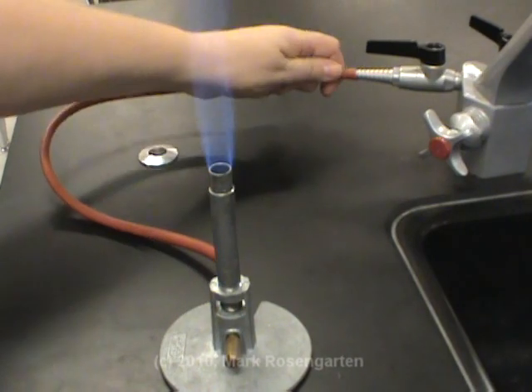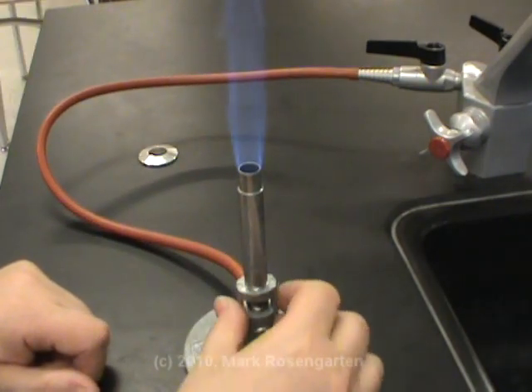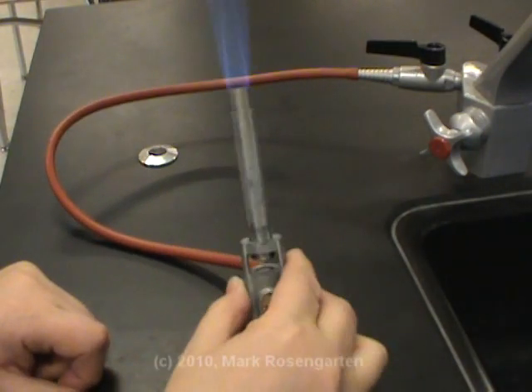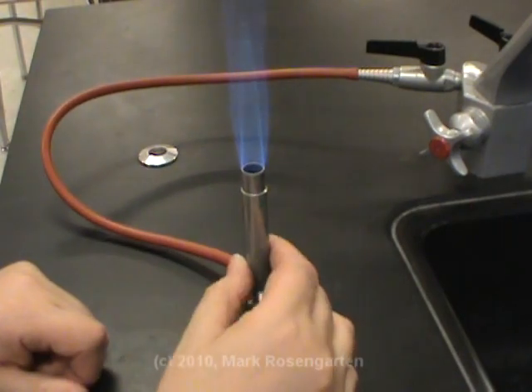This is a nice Bunsen burner flame right here. Nice and clean burning. But notice what happens if I open up the air — now there's too much air going through and the flame goes a little bit all whooshy on you.